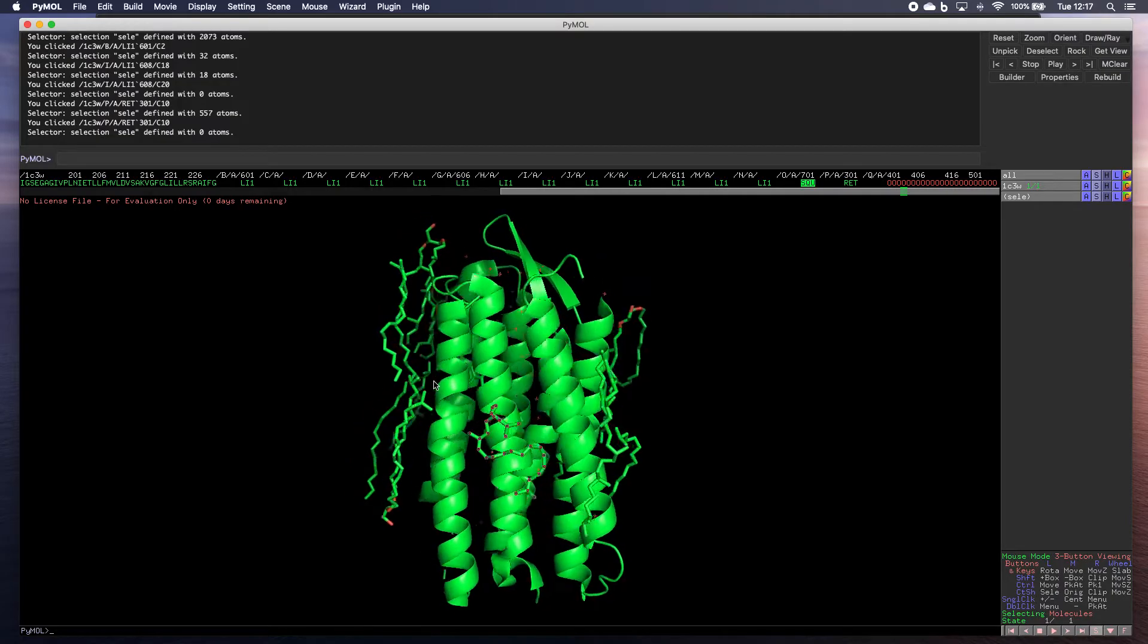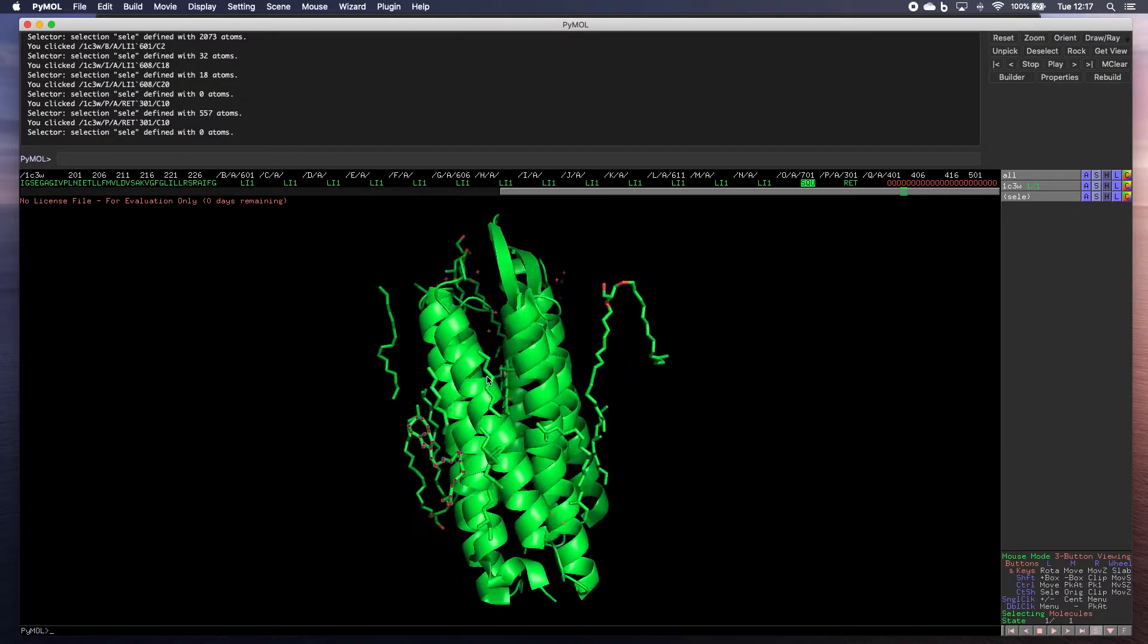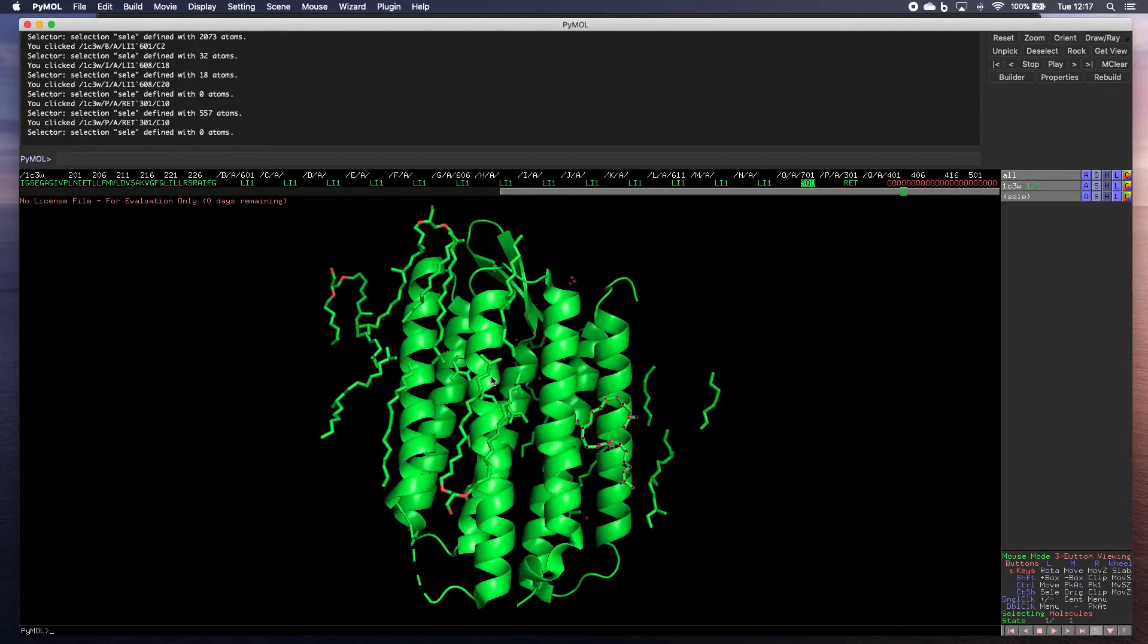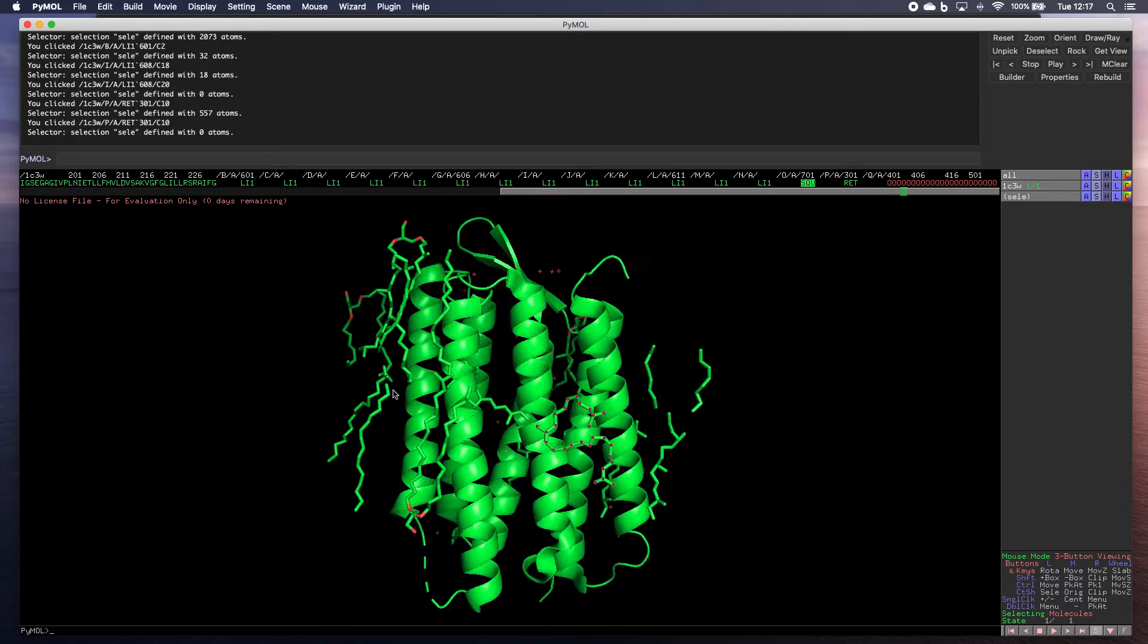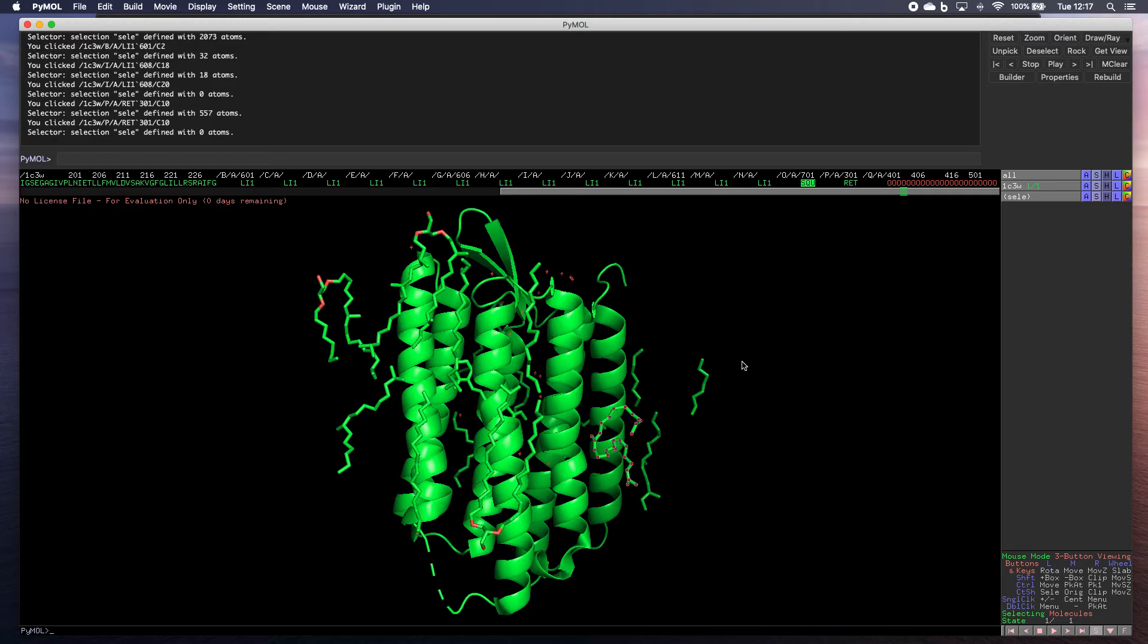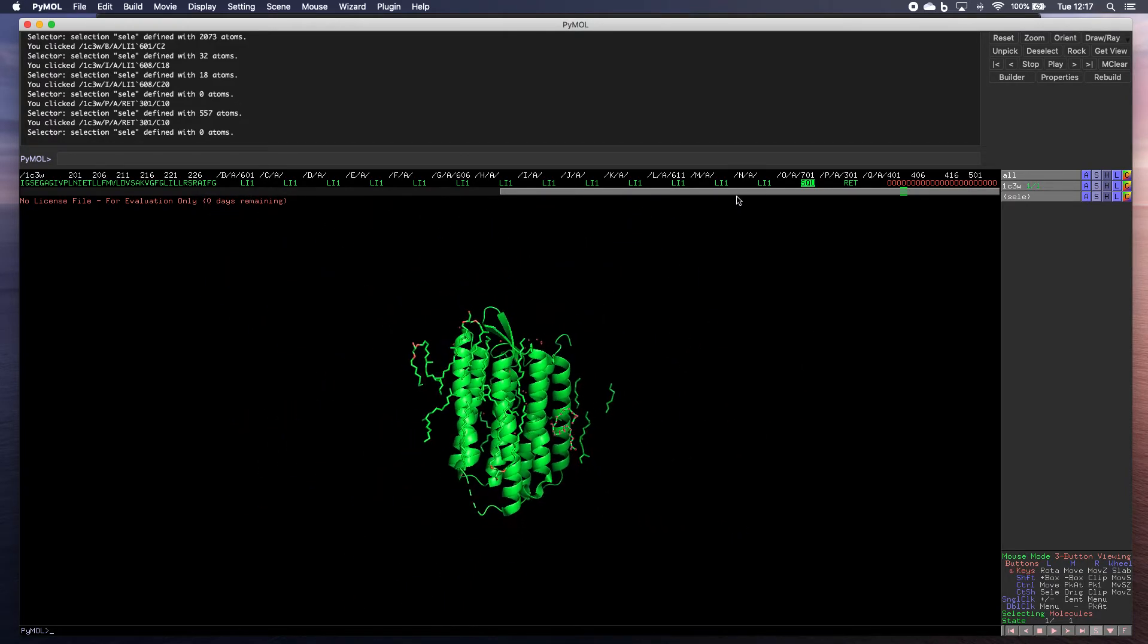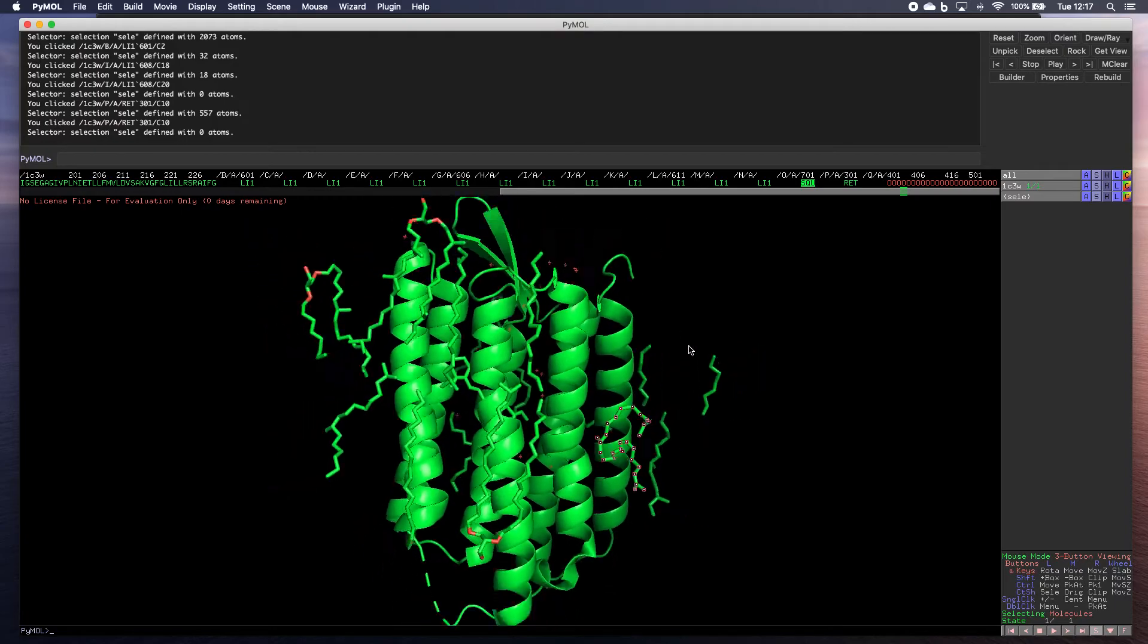Quick thing about how to control your image. So if you click with your left mouse button, you can rotate the image around. If you click with your right mouse button and move up and down, you can zoom in and out.